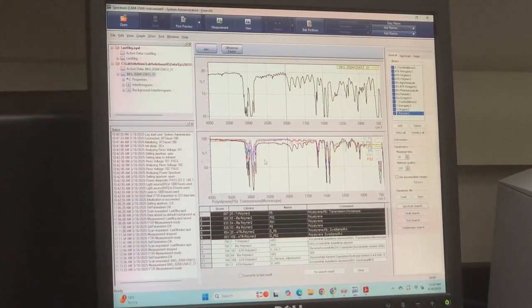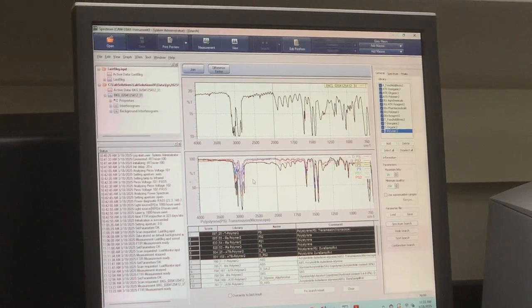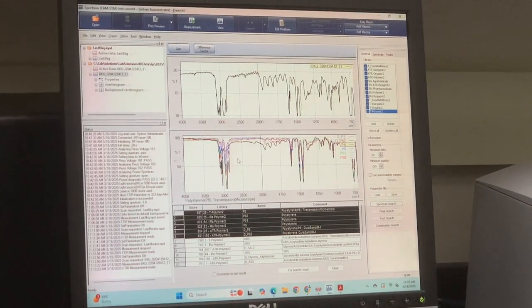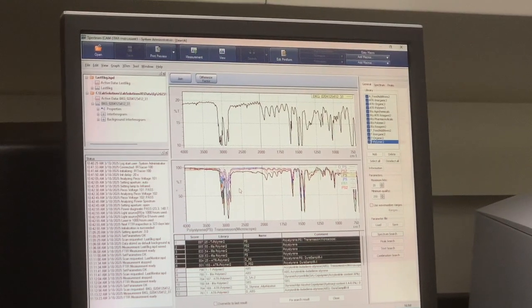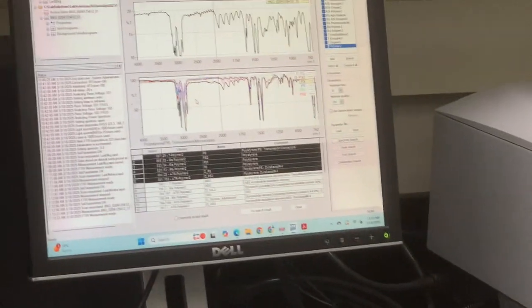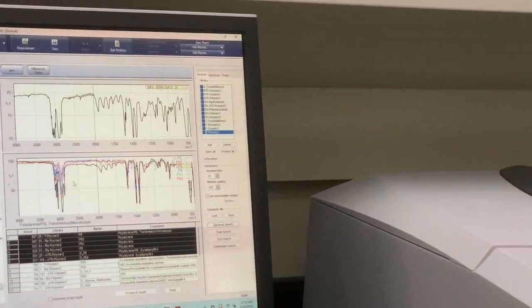Because now we're dealing with only one material. But later on, what is the goal here? Are you trying to stack layers of different material? Are you making solar cells? So what I'm showing is that I have this bare silicon wafer here. I have a little bit of silicon wafer, so you can subtract it out so you can see the other layers. That's a good strategy.